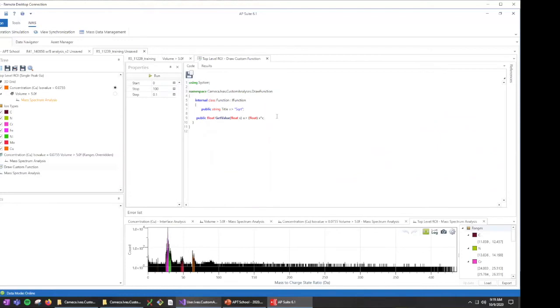I personally feel that for this type of thing, the best documentation is well-documented examples. If you have examples that show all the different API features, show you exactly how to use them, and are commented well, that's one. It's kind of self-healing. If you change the API, that will break your example code, and if your example code is broken, you know that you have to update. You either broke the API and you don't want to break it, or you've purposely changed the API and you need to update the example code.